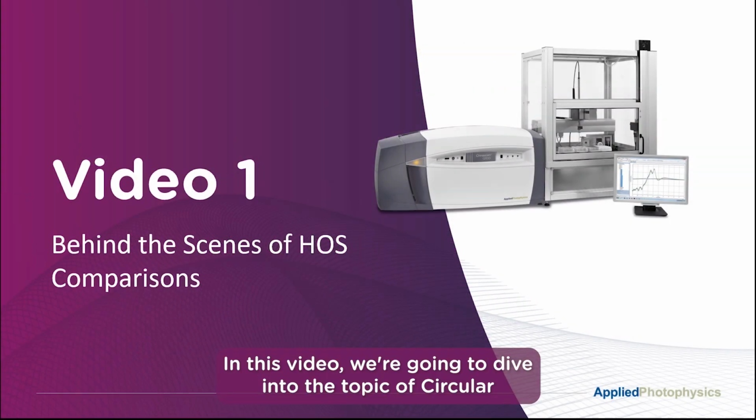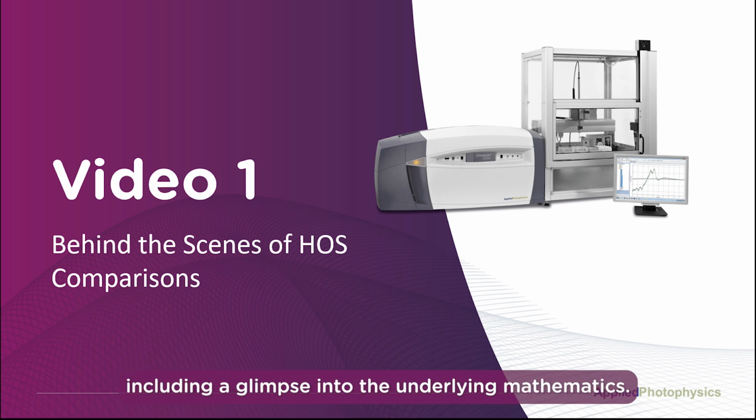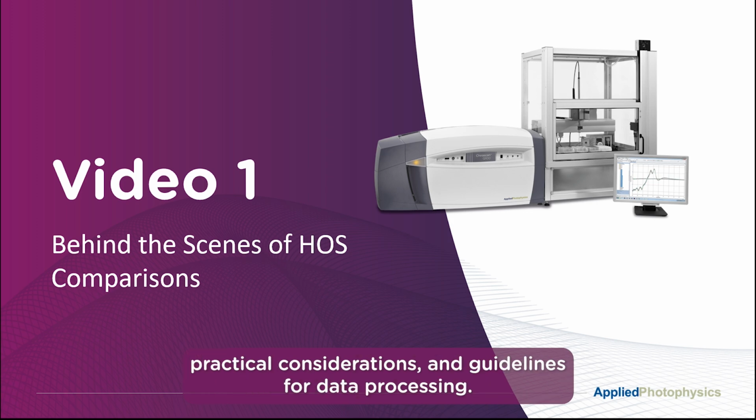In this video, we're going to dive into the topic of circular dichroism higher order structure comparisons, namely their applications, their use cases, and an overview of how they are performed, including a glimpse into the underlying mathematics. Subsequent videos in this series will cover specific case studies, practical considerations, and guidelines for data processing.